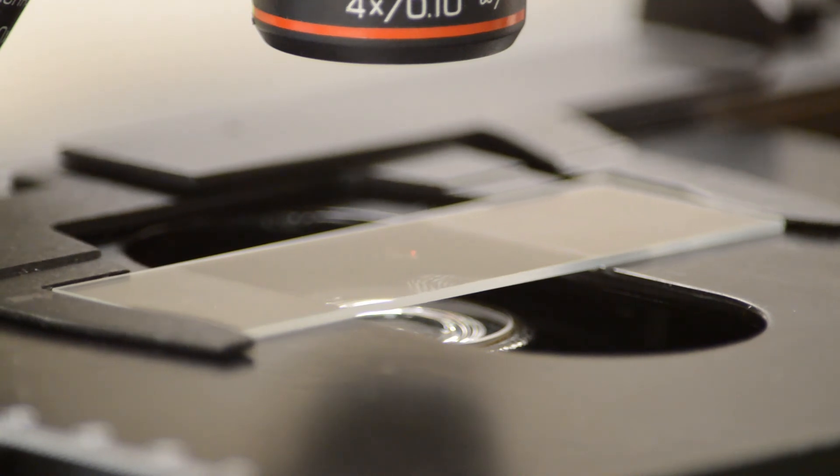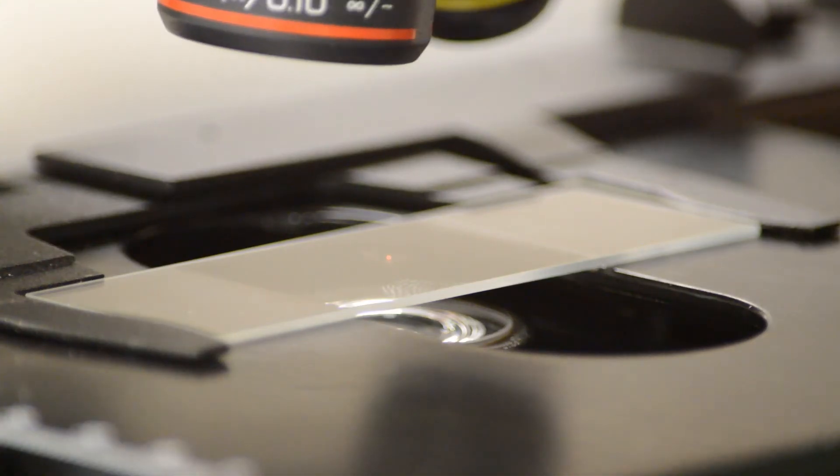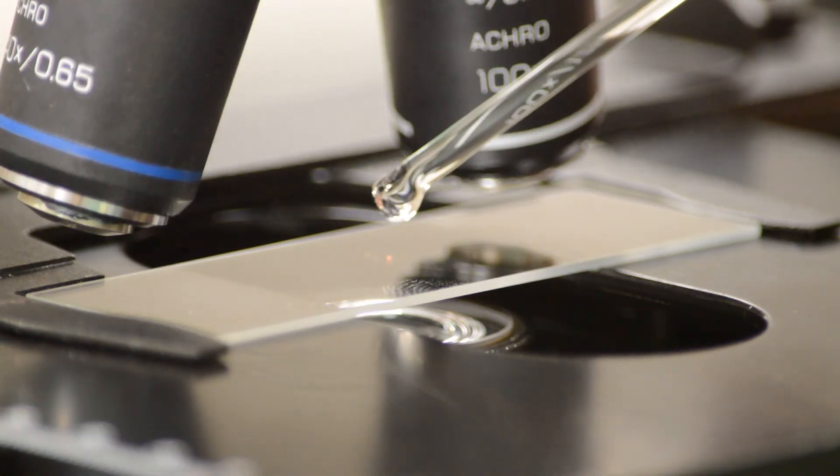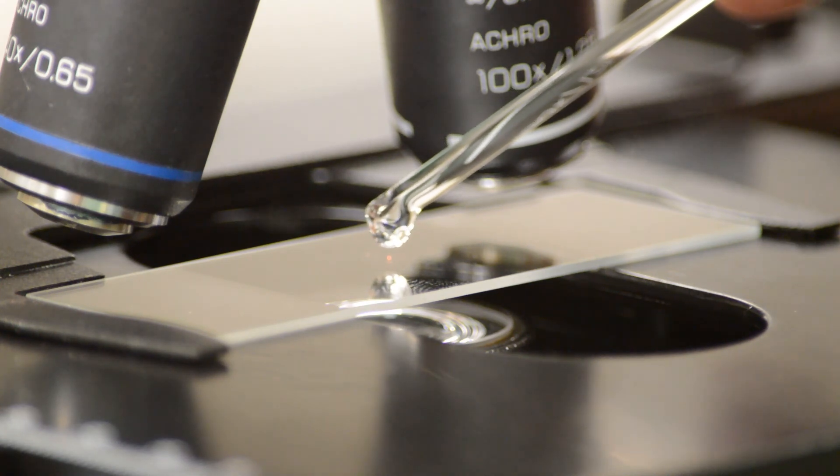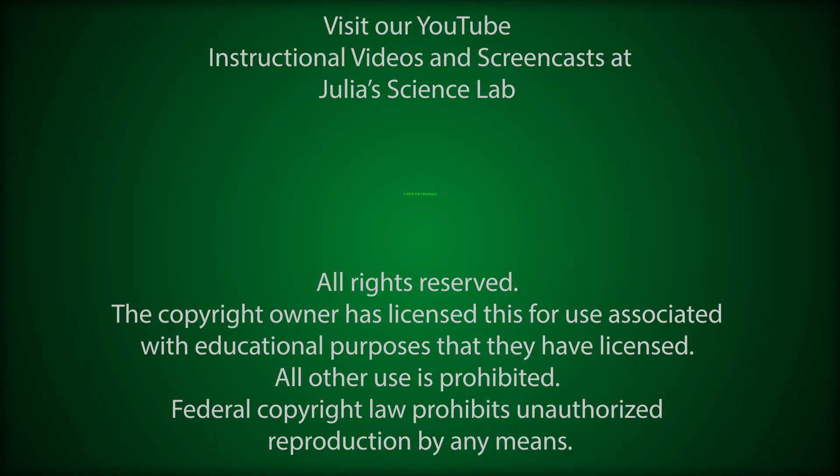So using the microscope is an integral part of microbiology. It just takes a little practice to be able to do this correctly. But once you learn how to do it you can use any microscope out there, and they all work virtually in the same manner.